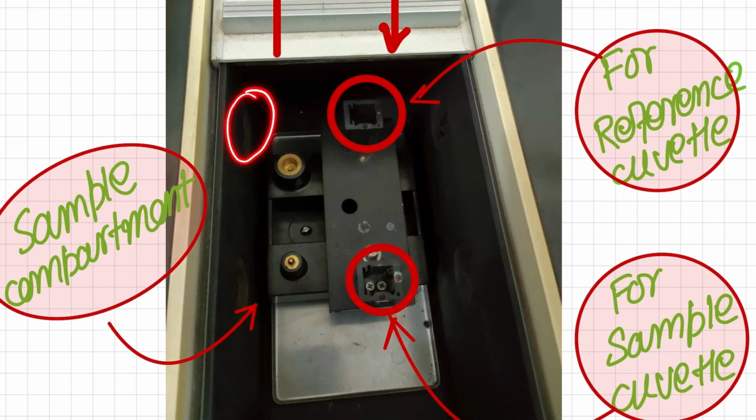If you see here, these are two small holes, and from these holes light is coming from the light source. So light travels from left to right, and similarly from this direction to this direction. This is the sample compartment, and you will note that inside it is all black, in order to avoid any stray light; the black material will absorb that stray light, and we will only observe the light that is coming from the light source.